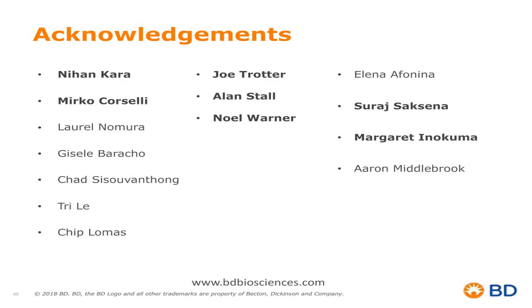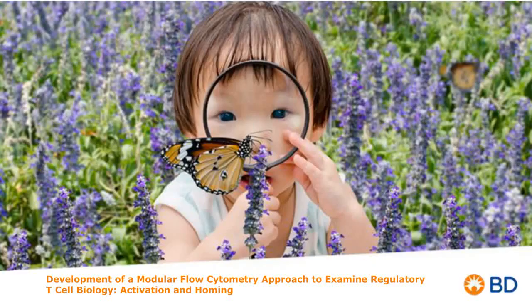Now, of course, that depends on your specific application, because something like a processed tissue or even PBMCs or blood that has been sitting around for a couple days, you'll start to see cell death, and we want to make sure that our data is as accurate as possible. In that situation, you can consider adding a viability dye, assuming that you have room within your instrument based on your configuration to add that additional marker.